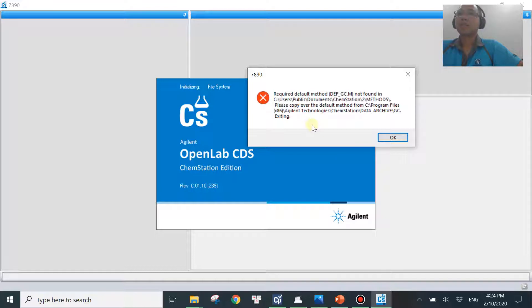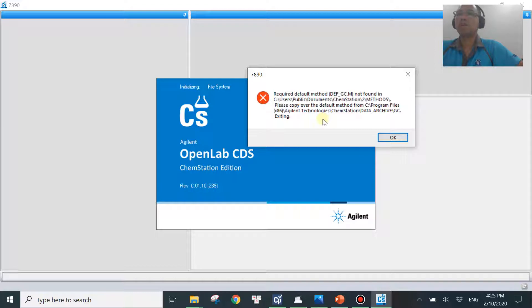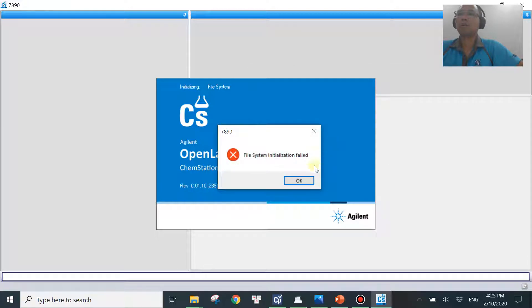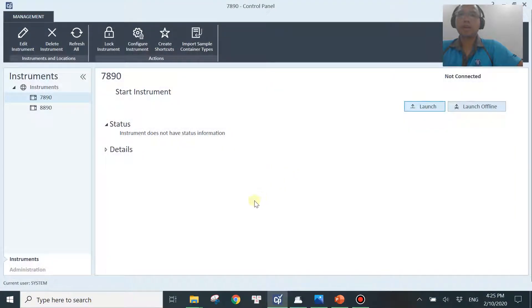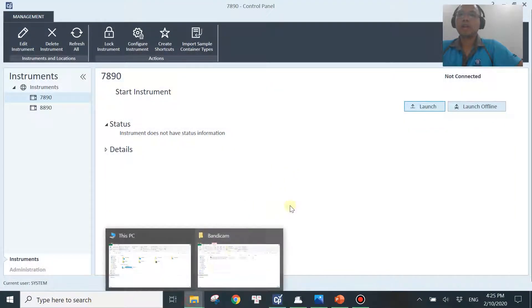The message actually tells you what to do: you simply need to copy back the default_gc method from the link provided. Once you do that, you should be good to go. Let me show you that — hit OK to close the error dialog.